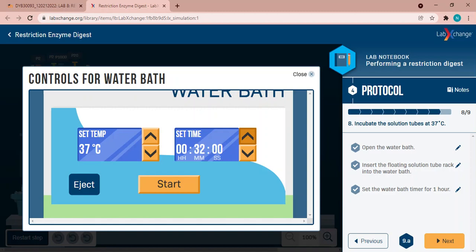Okay, set for 1 hour. Okay, wait for 1 hour.